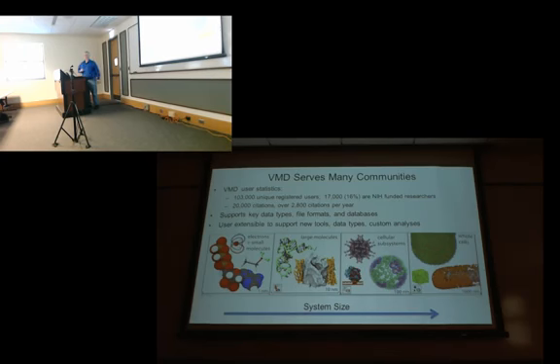And so one of the things that VMD allows is for you to extend the program with your own scripts and your own user interfaces, so you can customize what it does and how it does it for your particular work. This is a more advanced aspect of the program, but it's something to keep in mind, particularly for labs that develop their own software tools or their own simulation methodologies.